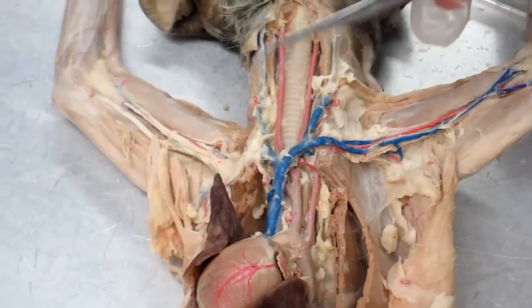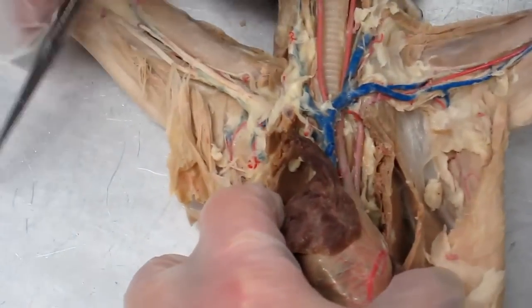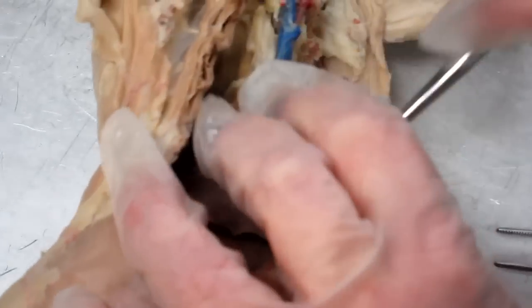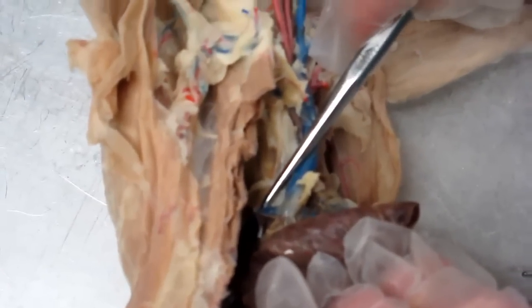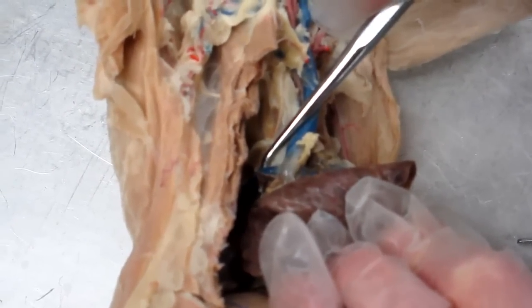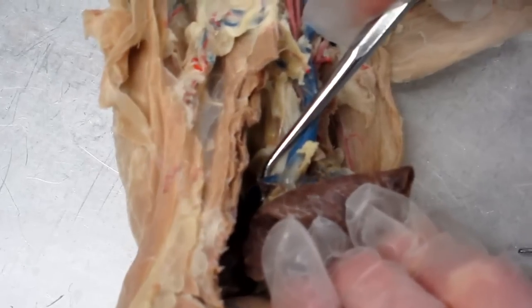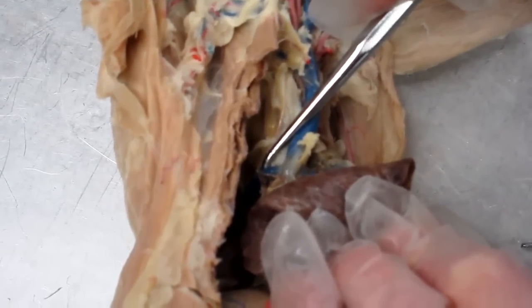Okay, now on the opposite side, we pull some of this material up. I swing our friend over here. We should see that there's a large blue vessel coming to the superior vena cava from the posterior chest wall. This is the azygos vein. Okay, so if you're looking on the right side of the heart, that's where you see the azygos vein coming from the chest wall.